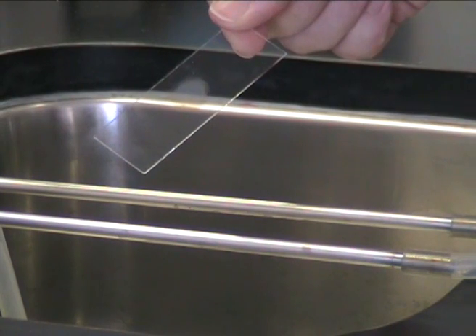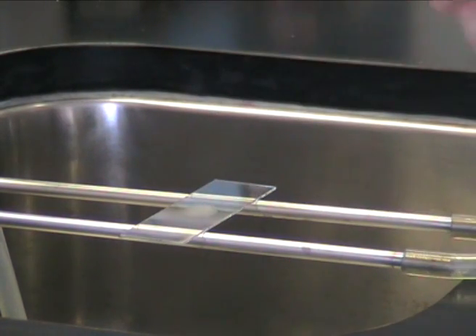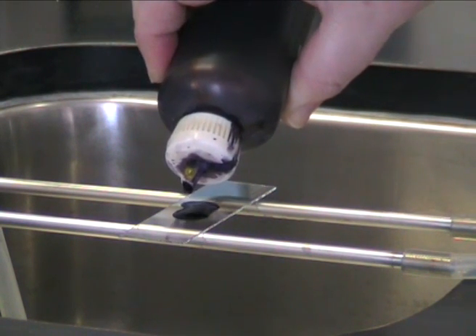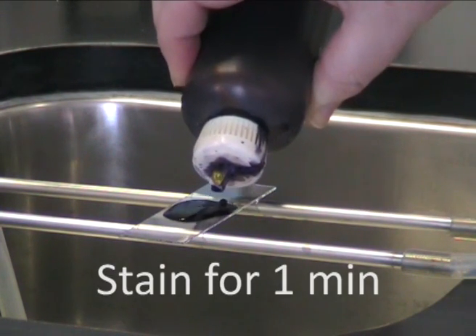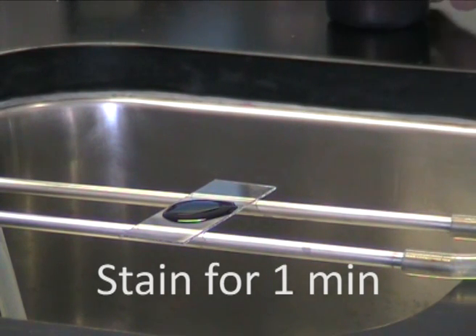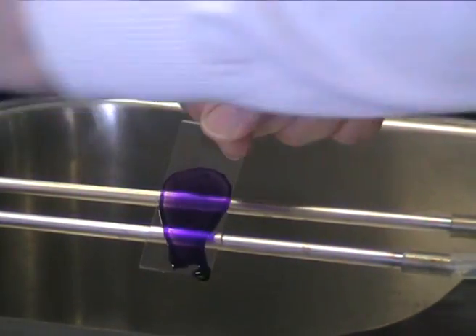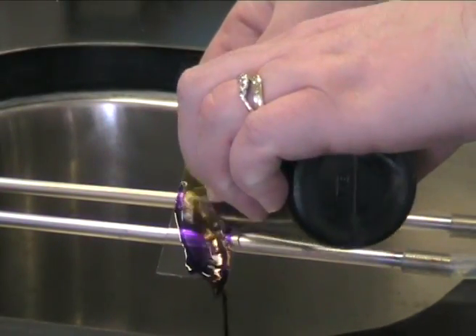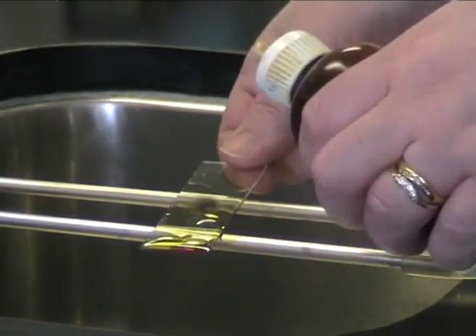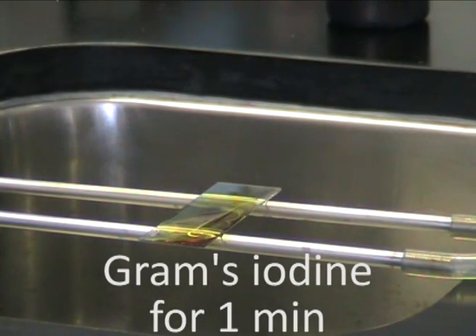We're now going to Gram stain your heat-fixed slide. Place the slide on the staining rack over the sink. Cover the smear with crystal violet, taking care not to get stain all over the slide. Leave this in place for one minute. Then tip away the crystal violet and wash the precipitate away with Gram's iodine. Cover the smear with Gram's iodine and leave for a further one minute.